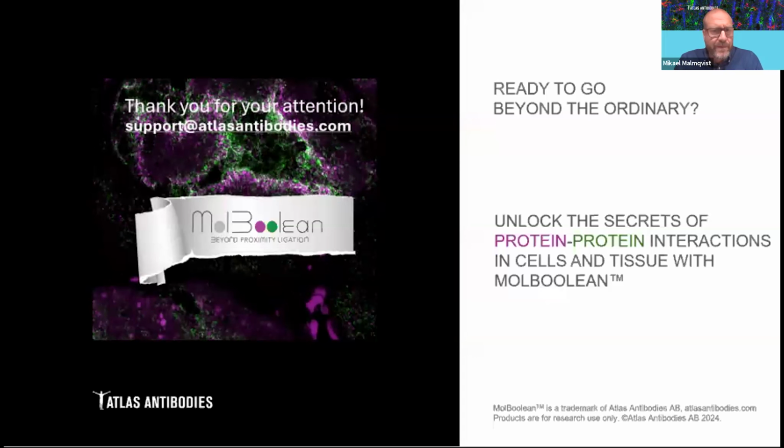Can MolBoolean be performed on live cells? The answer is no. You need to put in all the different enzymes within the cell. Maybe you can use MolBoolean on the surface of the cell, but within the cell, I would not do that. If you want to study processes in living cells, I would rather go for fusion proteins and a FRET-based assay. So there's no method that is best in everything. You have to look at what is the question you want to answer. Great.